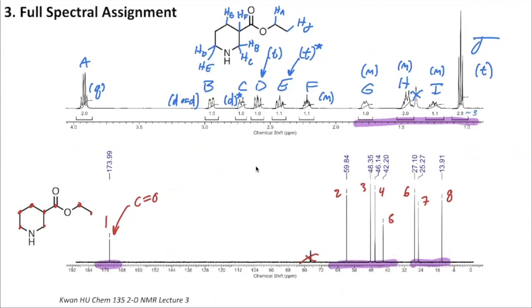And then we have H and I remaining. We said that H is 2 protons, and looking at our HSQC data, we saw that it seemed to correspond to 2 different carbons. So I think it makes perfect sense to split up 2 different protons H here, because that's what our HSQC data is telling us that we need to do. We'll come back and double check with that later on. But I'm going to fill in HH, also attached to the same carbon with Hg, and then the other HH, we'll call it H prime, will go on the adjacent carbon here, along with HI. Ooh, okay, we did it.